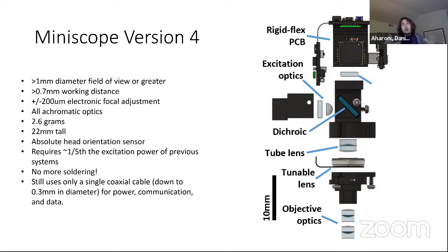And then, our collaborators use these miniature microscopes, but we really want anyone to be able to use and feel comfortable using these systems. So we try to make the assembly as easy as possible. These are 3 machined housings, which are easy to get or to make yourself, and you just pop optical components inside them. For a lot of neuroscientists, what they're worried about is, one, maybe you've never worked with optics and you're worried about assembling. You can do a surgery in an animal, you can push some lenses in some plastic housings, but oftentimes people are worried about having to solder components on a circuit board and ruin something. So our newer systems are these rigid flex circuit boards that, if you got it from an open source distributor, come fully assembled, and there's no soldering involved at all. And when you want to connect a cable, it's just a small, tiny coax connector that you snap on. So they're really easy to assemble.